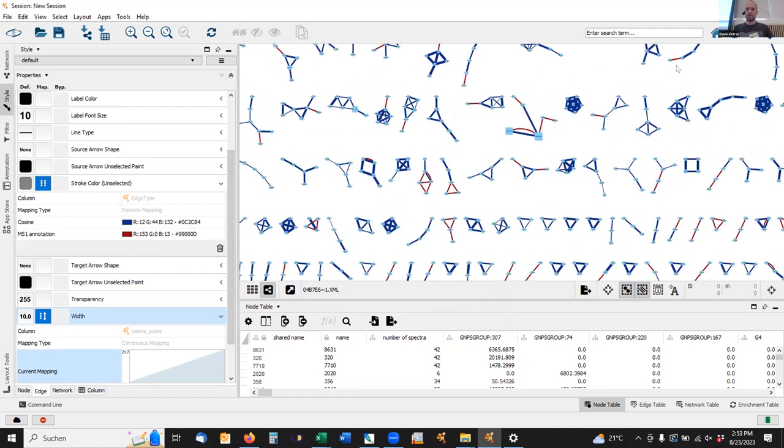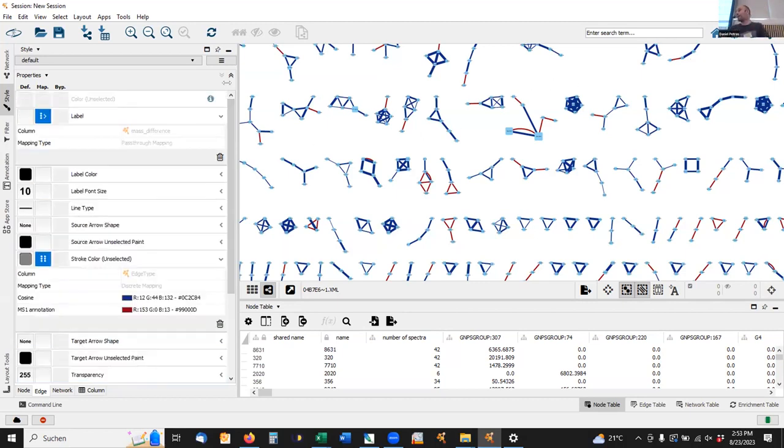All right. So now I think we get already some more information into this network, but of course, what about biologically relevant information? Particularly these A-B questions are classic scenarios. You have a knockout mutant, or you have two cohorts, say your treatment group and your control group, and you want to check, okay, are those features differentially abundant in here? And this is where the metadata comes in very, very handy. You want to provide this design, this experimental meta information about your samples, already into the analysis of GNPS.